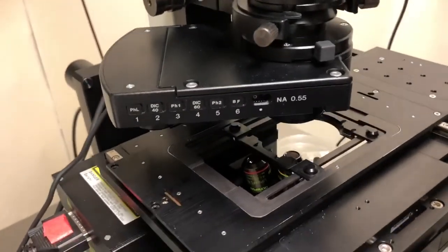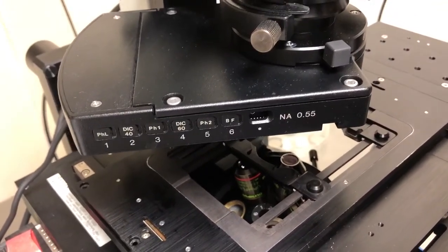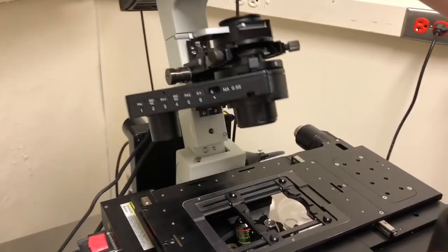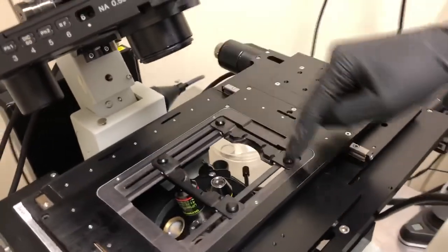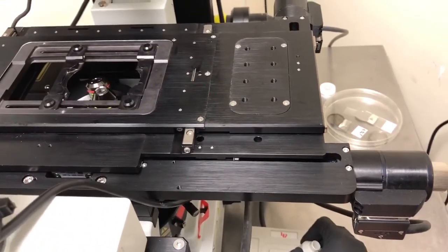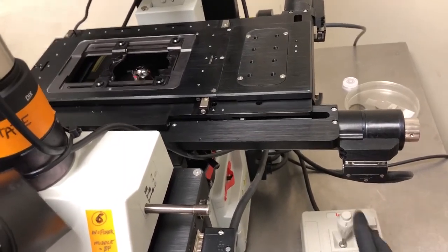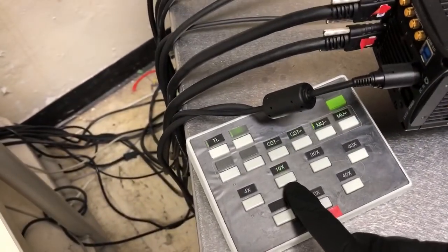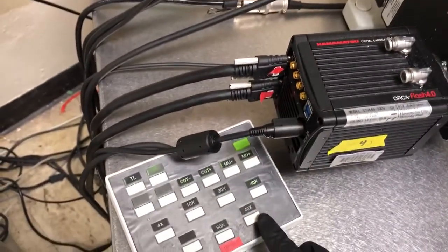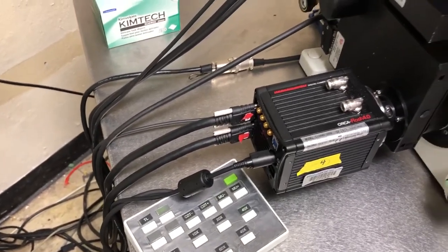This is an inverted microscope — the objectives are down there pointing up. So we need to place our samples with the cover slip pointing towards the objective, so pointing down. The sample holder sits on the motorized stage, which can be moved with the joystick. You can move the stage more quickly by pressing and holding the speed button. You can change the objectives by pressing the buttons here — 10x, 20x, 40x, and then positions for 60x and 100x oil objectives, which are not always on the microscope.